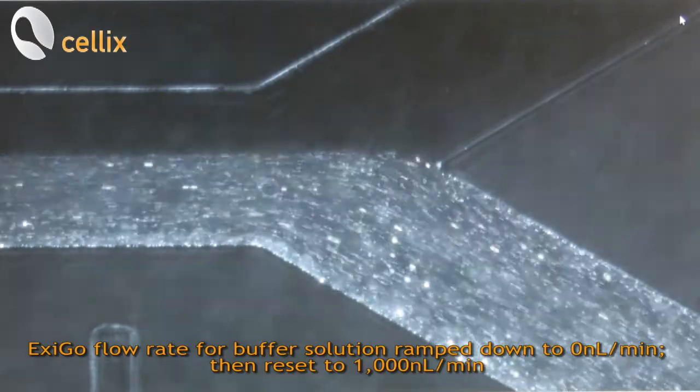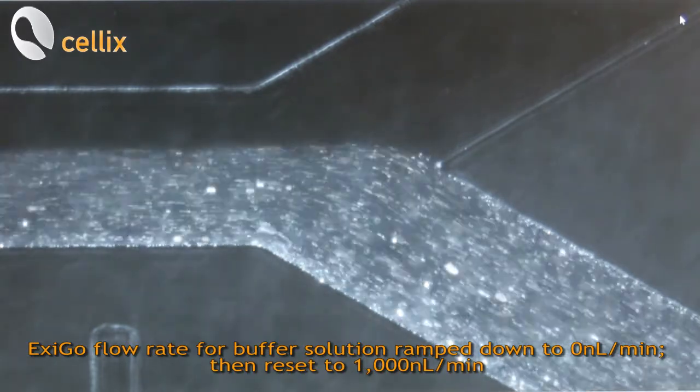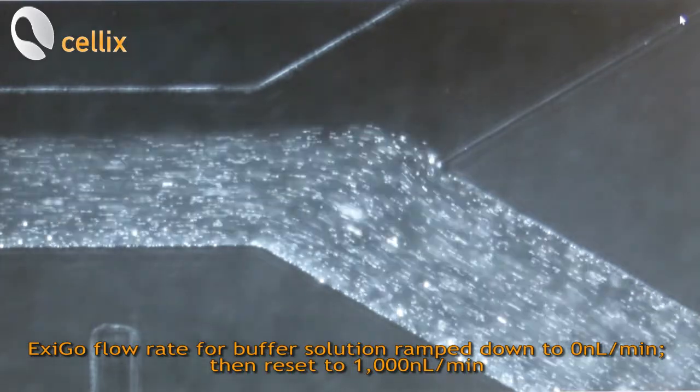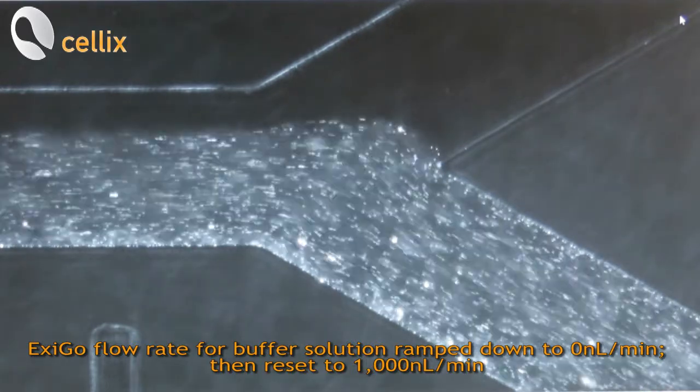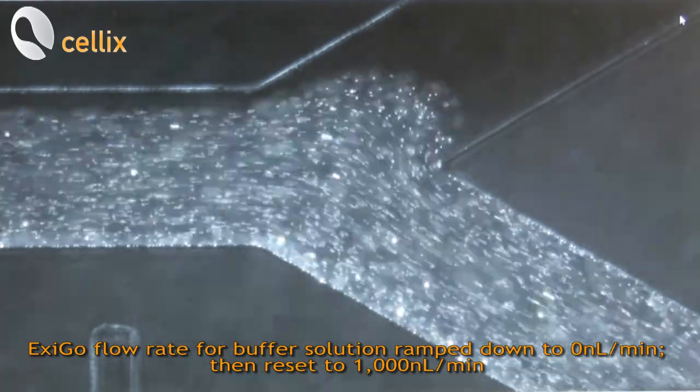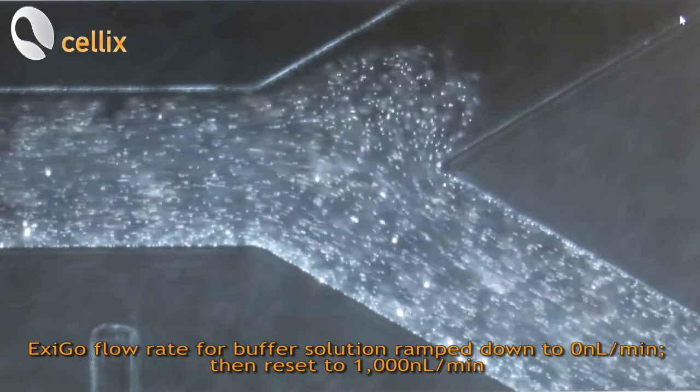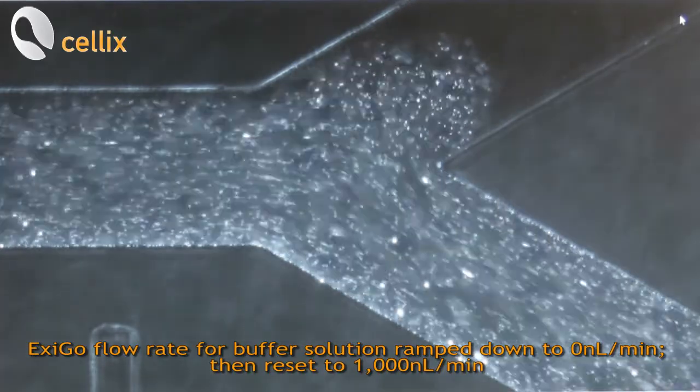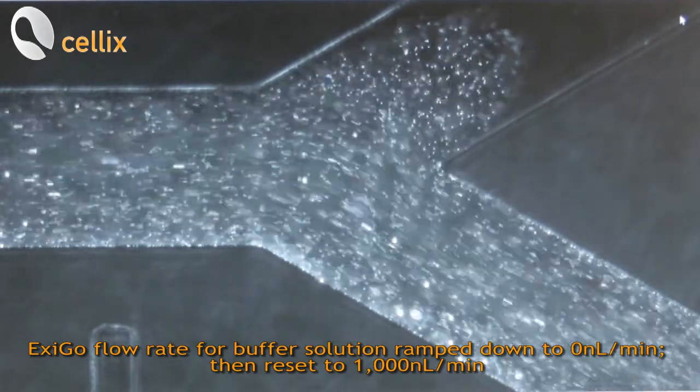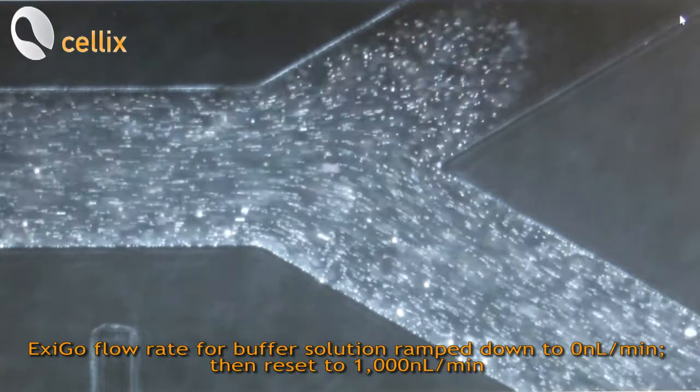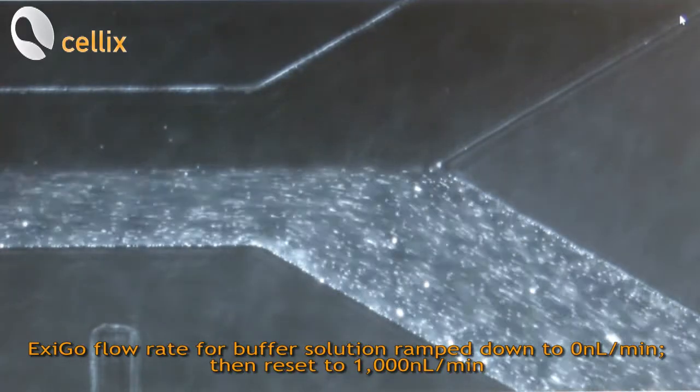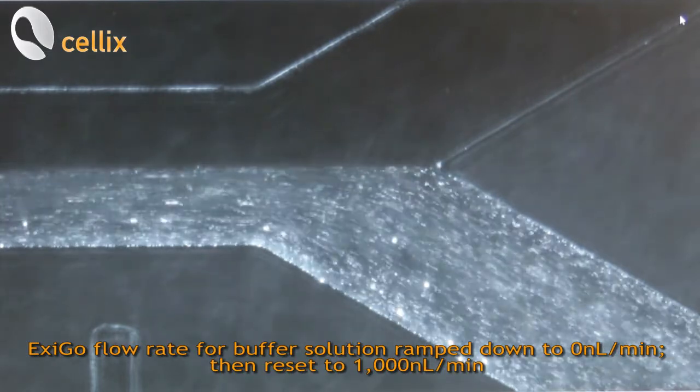As we can see now we are running the program so the interface is drifting towards one side because the buffer solution is actually reducing the flow rate. So the buffer solution now has a zero nanoliter per minute. So just particles are flowing into the channel. And now again the flow rate has been set to 1000.